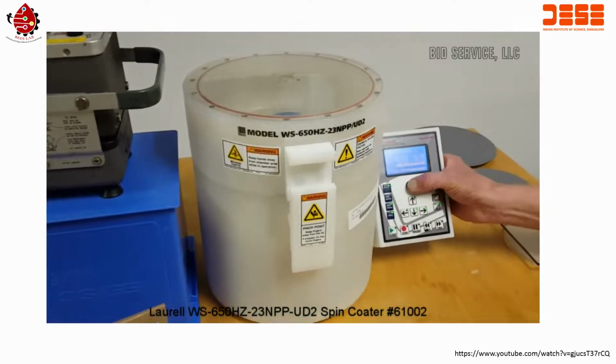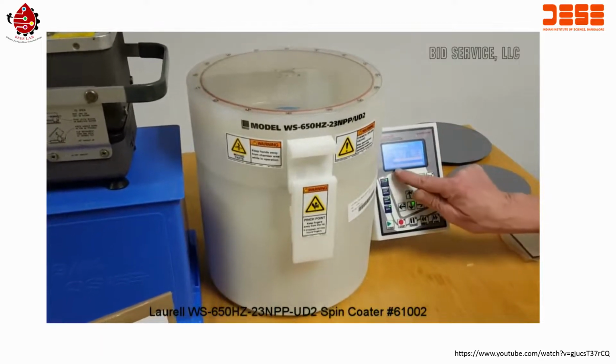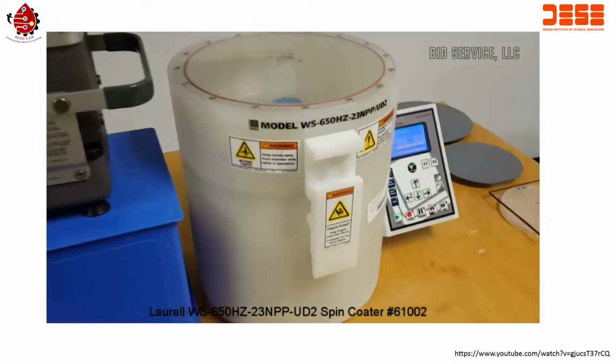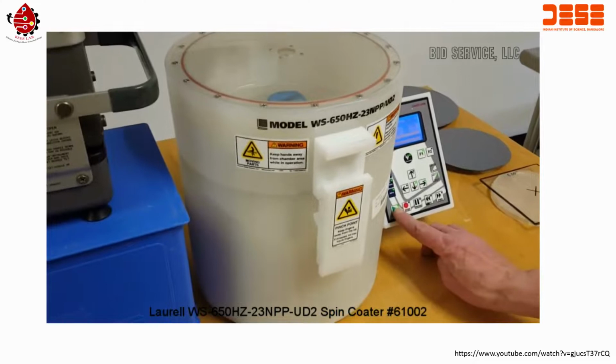First we will apply a vacuum. It tells us that we are ready. And we'll go.